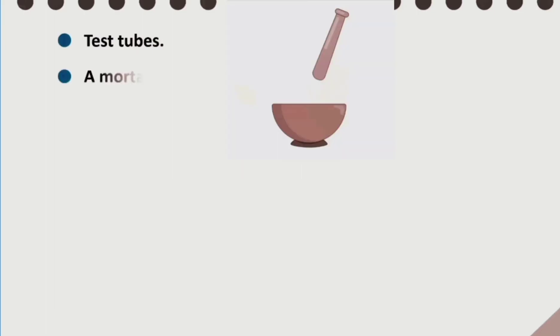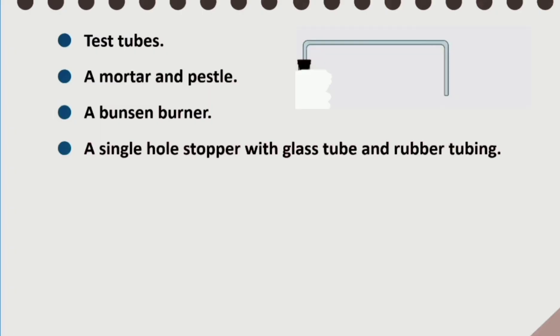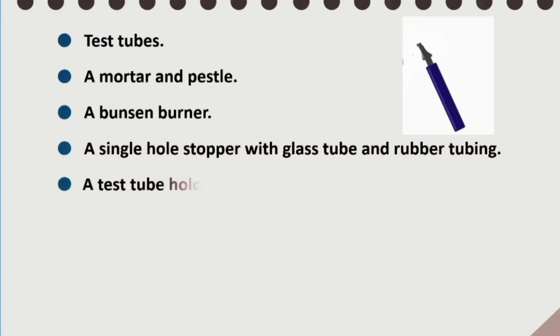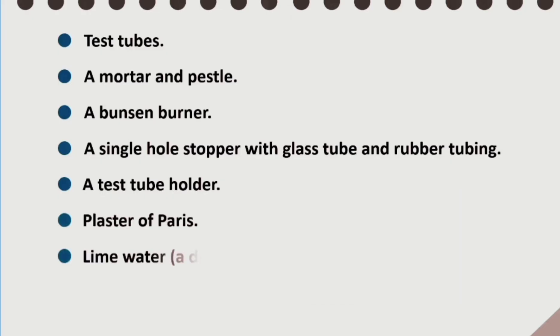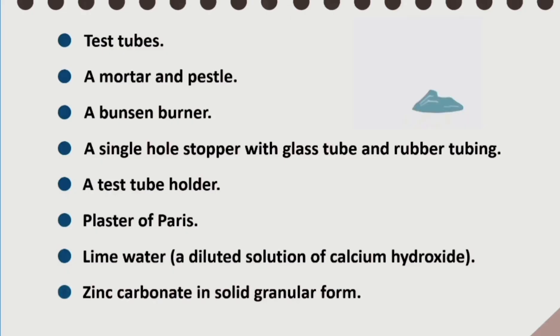For this practical, we will use these apparatus: test tubes, mortar and pestle, a Bunsen burner, single hole stopper with glass tube and rubber tubing, a test tube holder, plaster of Paris, lime water which is a diluted solution of calcium hydroxide, and zinc carbonate in solid granular form.